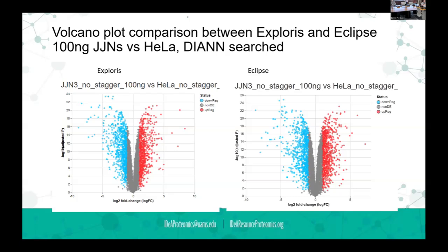So then we set a minimum signal for detection and raised the fold change from 2 to 2.5. And then we get like 88% overlap. The numbers go down, of course, but then you start to believe, and then we start using that for our real reporting.